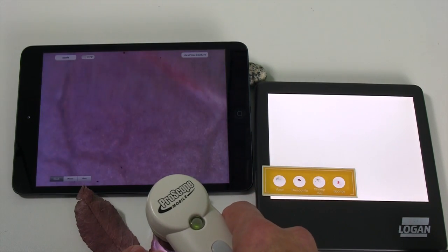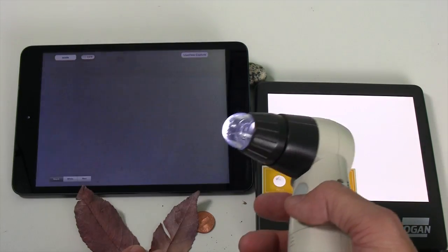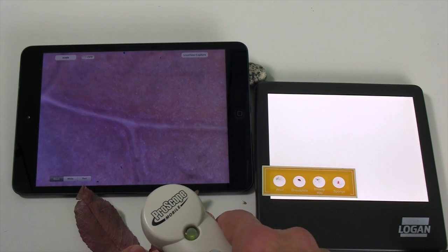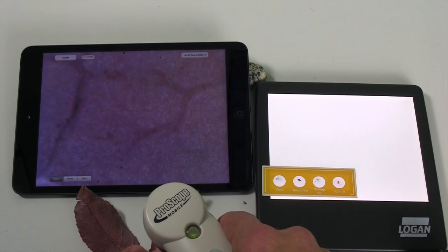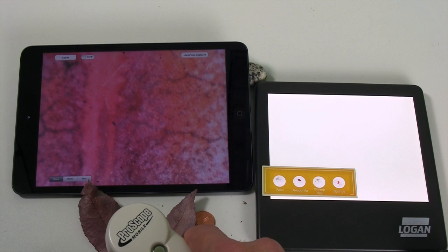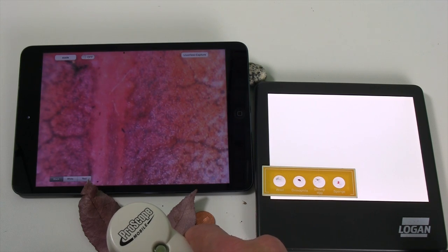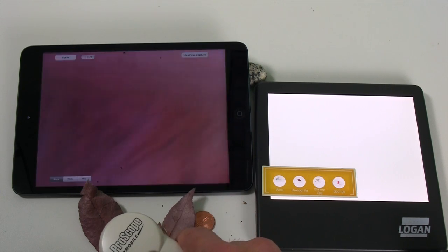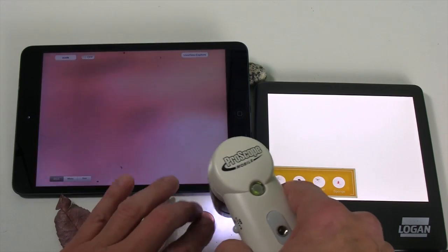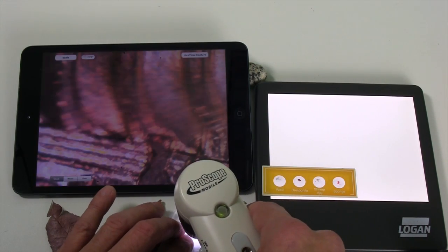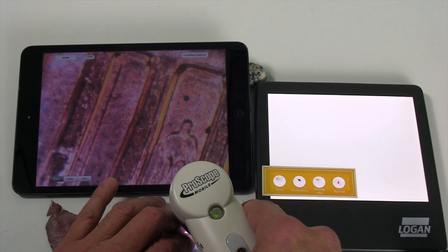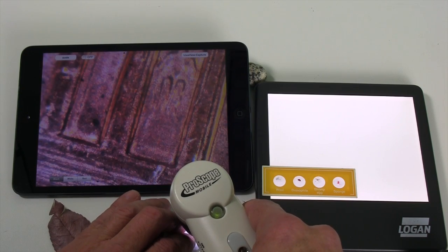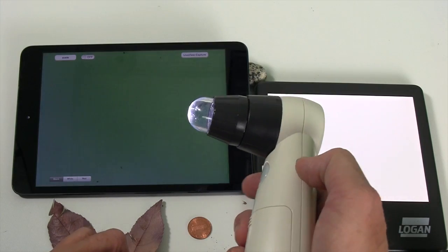So here's the leaf. Now I'm using this with the light, so it's reflective view right now, but I'm going to show non-reflective. You can see more of that leaf than you would be with the 50 or the 30 or certainly the 10. And using our penny as the reference, back to Lincoln and the Lincoln Memorial, and you can see he's much bigger.